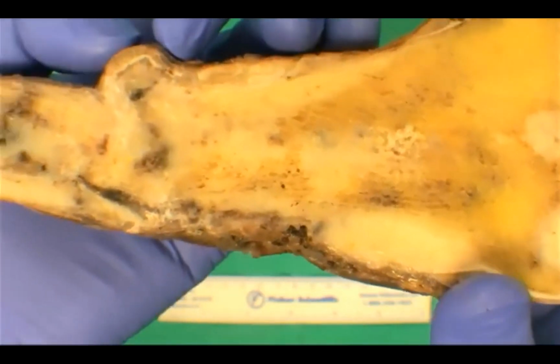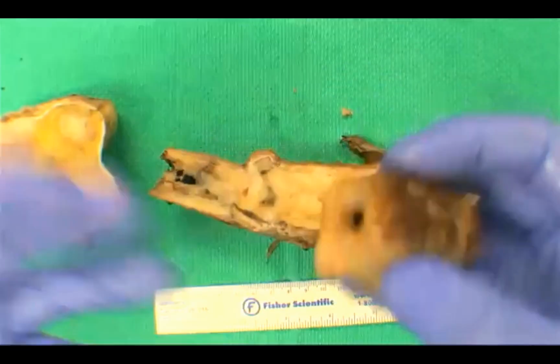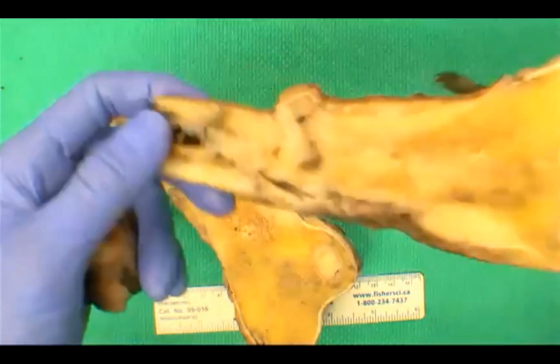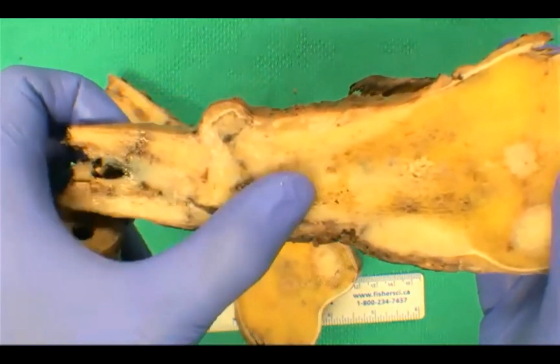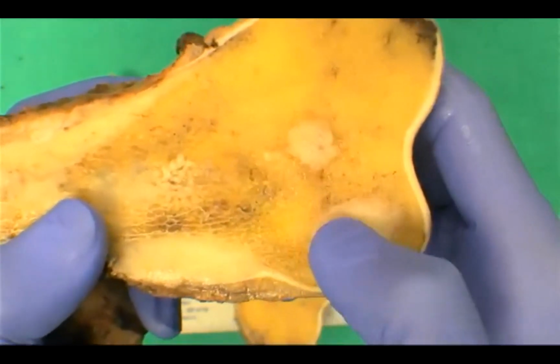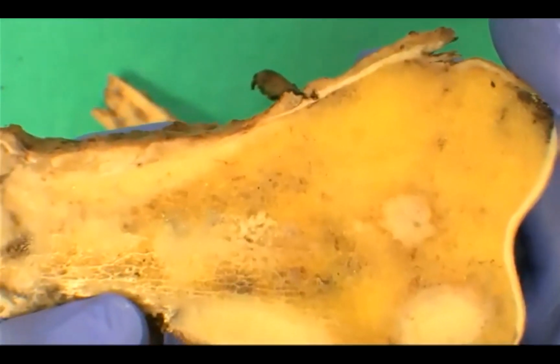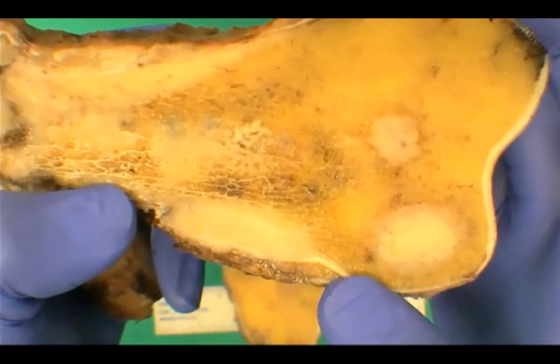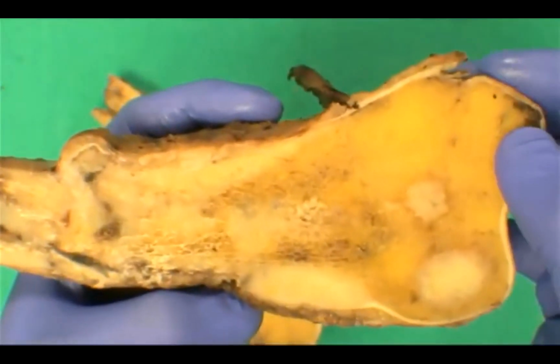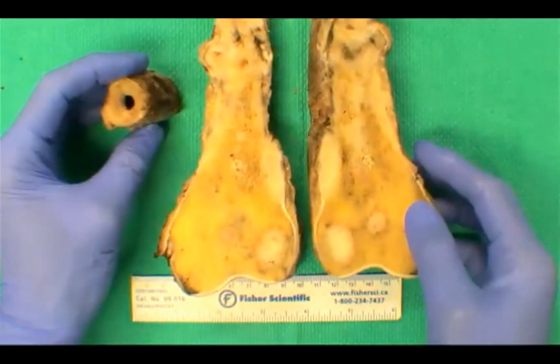Okay. In terms of a gross description, we're still looking at a very similar approach. We're going to measure and document the fracture site, the involvement of this fracture site by some of this gray and white and some of these areas of softening. We'll talk about different foci of softening through the bone and in the adjacent soft tissue, and also comment if any of the cortex of the bone has been breached or not. What we'll generally do is take a nice 5 mm slice from here with the saw that we've got, and from there block out each section and then map it out onto a specimen map.